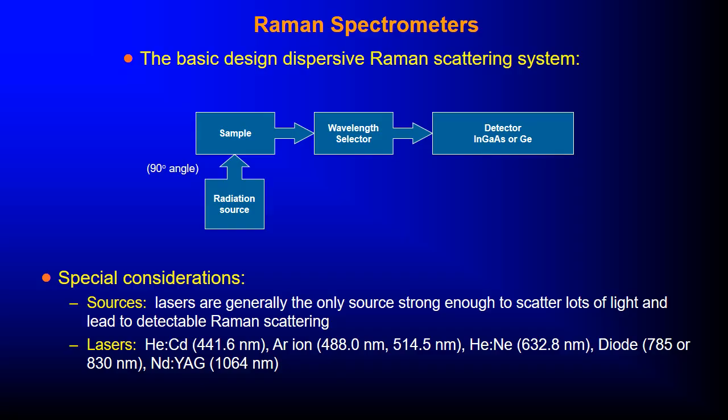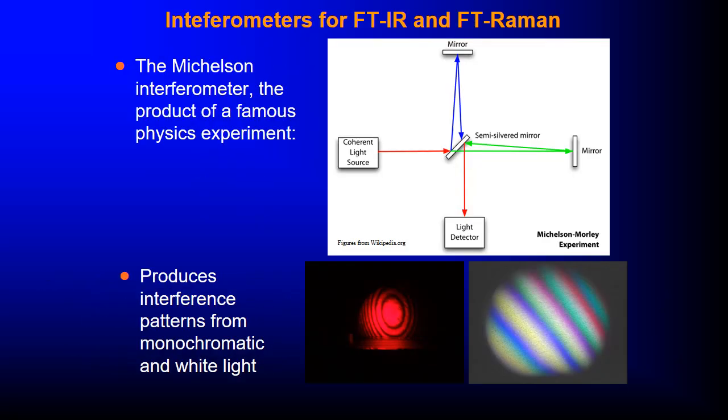Then we have, there you can find many of them that are provided. Then the same problem that infrared has, we also face in Raman. Now we need to modulate these signals.